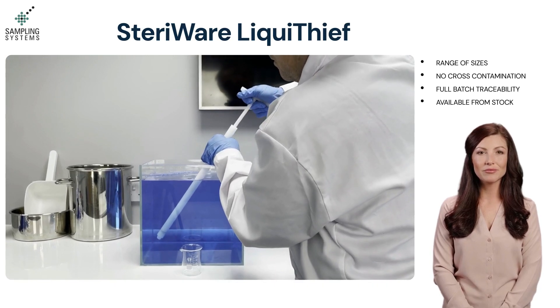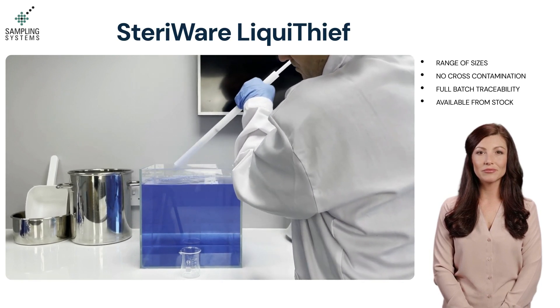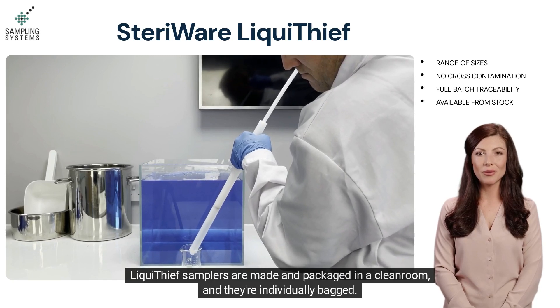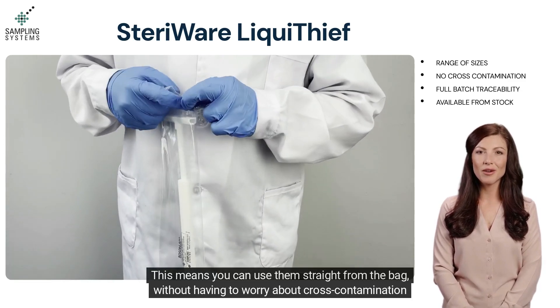The further you pull, the larger the sample volume will be. Liquid Thief samplers are made and packaged in a clean room, and they are individually bagged. This means you can use them straight from the bag without having to worry about cross-contamination or cleaning.